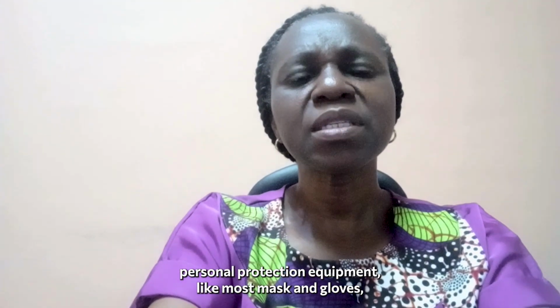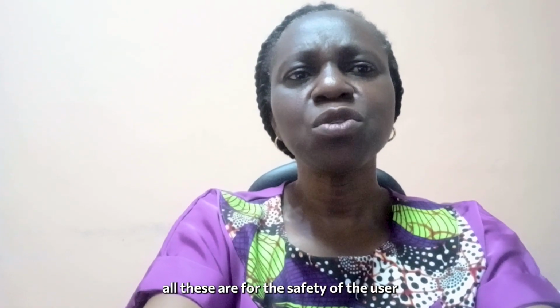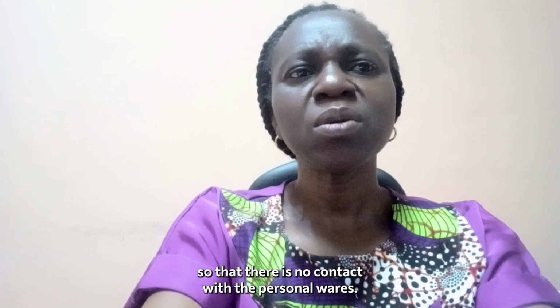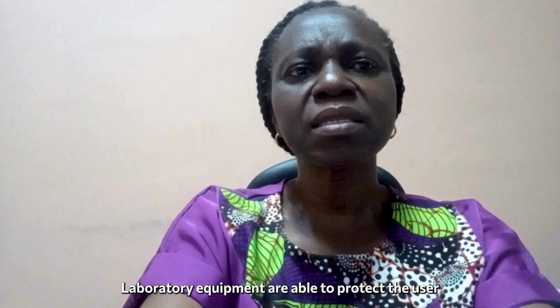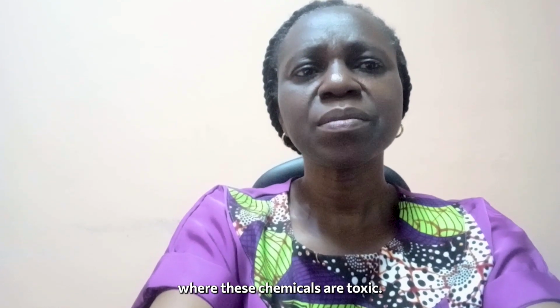Then the use of PPE, personal protective equipment, like nose masks, hand gloves, laboratory coats, laboratory shoes. All these are for the safety of the user so that there is no contact with personal wares. This equipment is able to protect the user from having contact with chemicals, most especially in situations where these chemicals are toxic.